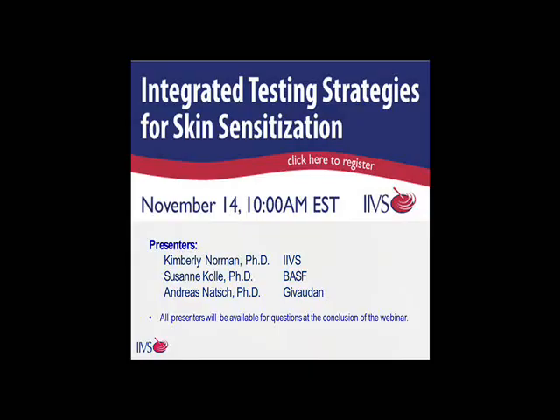Today's webinar will include an introduction and background information on some of the in vitro methods available for skin sensitization testing, how they can be combined into integrated testing strategies, and some real-world application of the strategies for assessing hazard and potency of materials. The webinar will also include about 15 minutes of question and answer time.